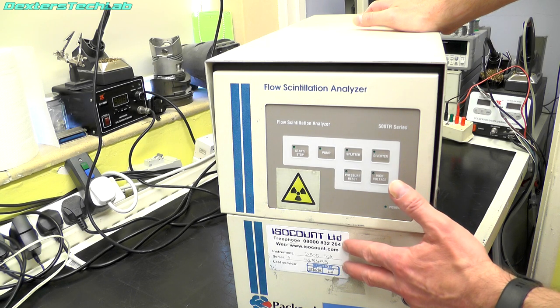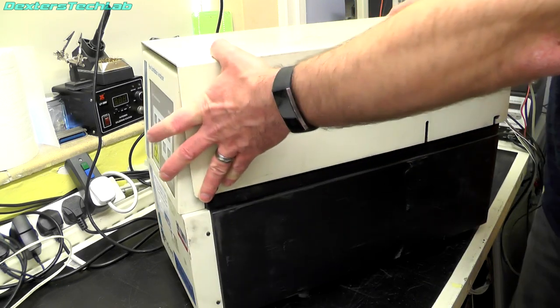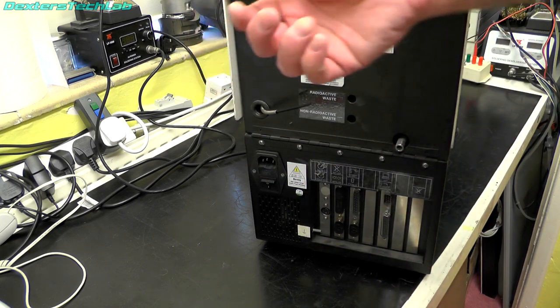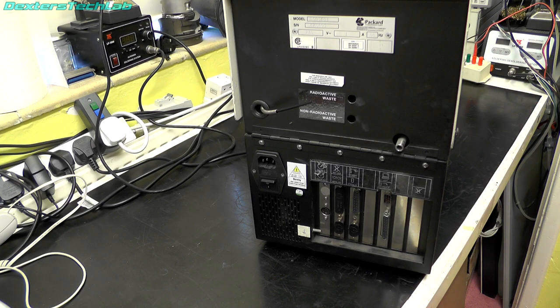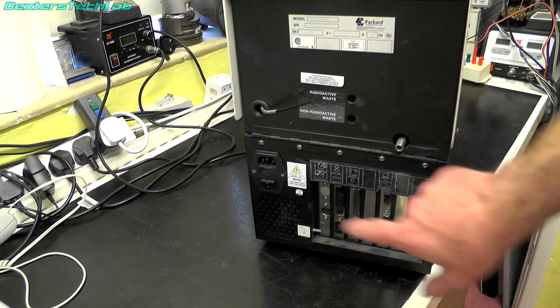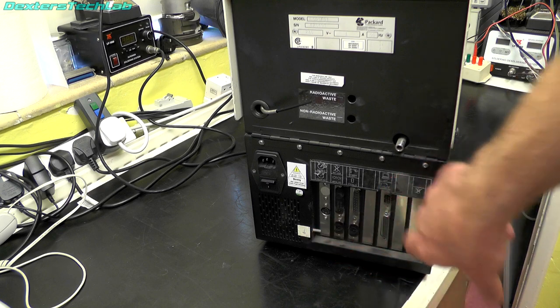There's a sticker saying 'ISO Count Limited' — that looks like a company that maybe services or rents them out. Not a lot to see on the front. Turning around to the back, there's a sticker showing the model number and voltage rating. We've got a number of pipes coming in and out — radioactive waste and non-radioactive waste — and another pipe with some fluid in it which I've already checked. Interestingly on the back there's a backplane with some cards plugged in that look very much like PC interface cards, so we'll certainly be interested to see what's inside.